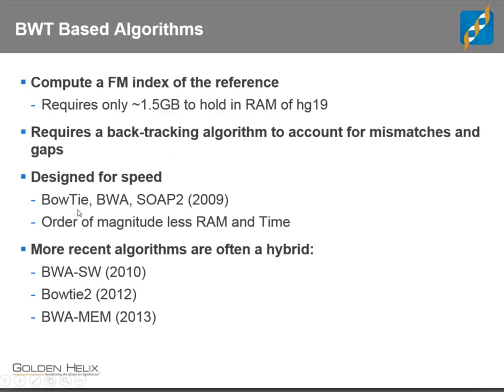One thing we'll touch on is that Bowtie, in its implementation, in its backtracking algorithm, did not account for gaps, so it could not do insertions and deletions. Super dang fast, able to really quickly align things, but no gaps. BWA did account for gaps, and so did a couple algorithms and many other things that followed it.